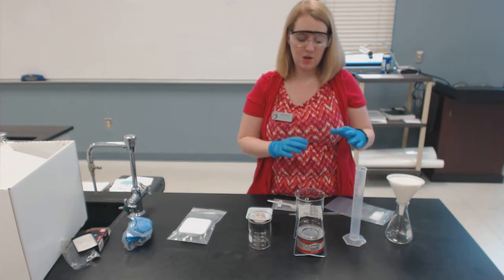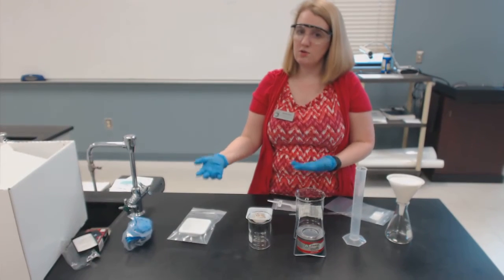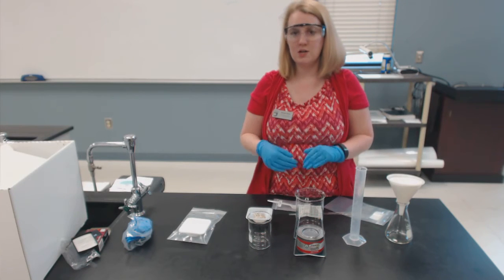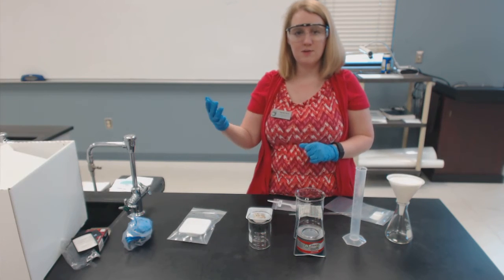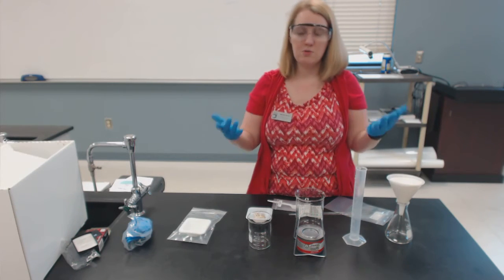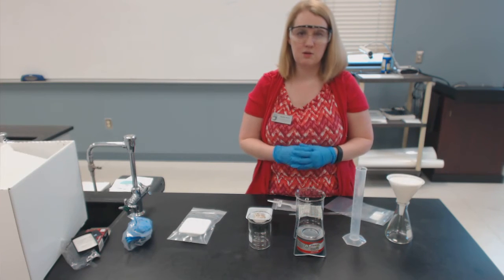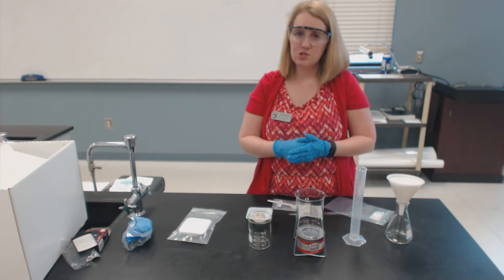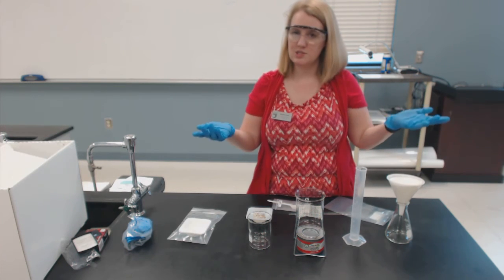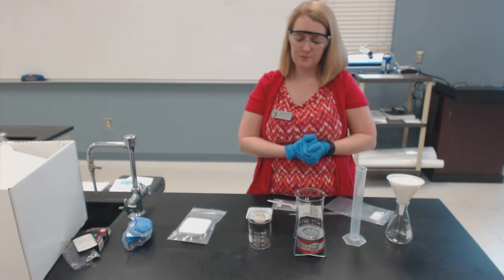What can you determine? Did you spill something at some point? Make sure you record that because that's going to cause your numbers to be different. Anything that happens, even if it is a mistake, you need to record that in your results section. That way, if your result numbers don't seem to make sense, in your conclusions, you can state that. The numbers were lower than normal because there was some sand we couldn't get out of the bottom of the beaker. Put that in your conclusions, but make sure it's referencing something that was mentioned in your results. Otherwise, it's just sitting alone there with nothing to back it up. So you need to document everything.